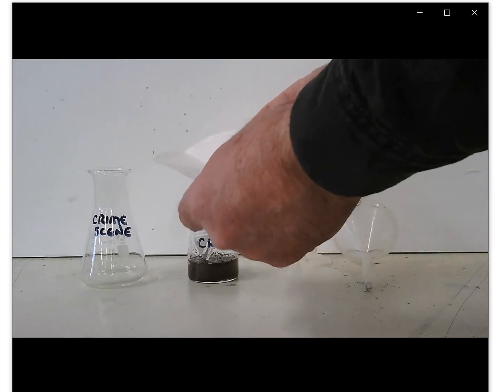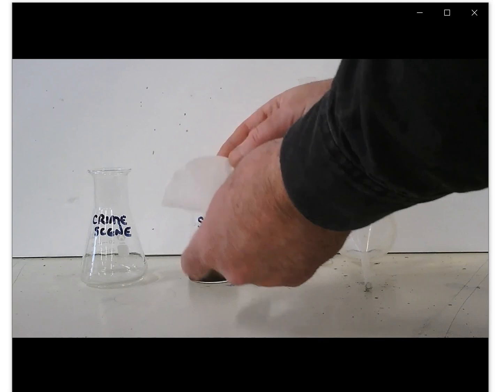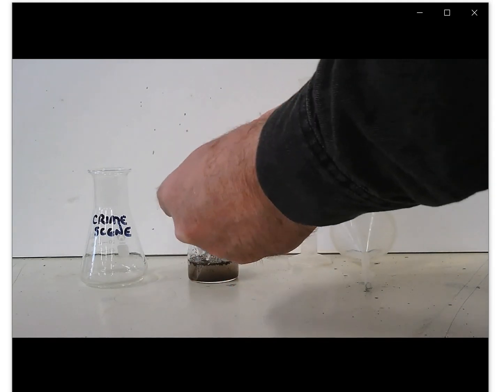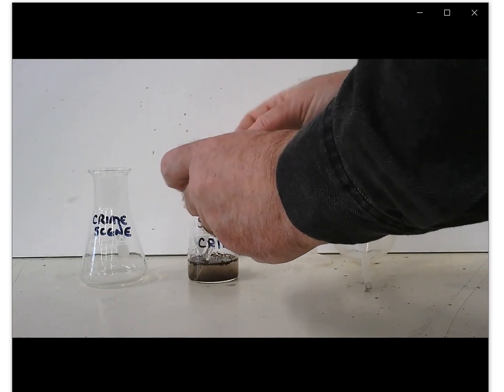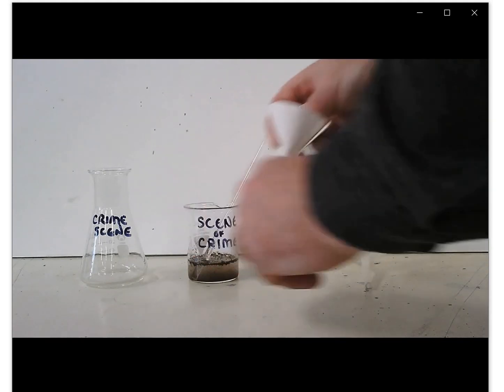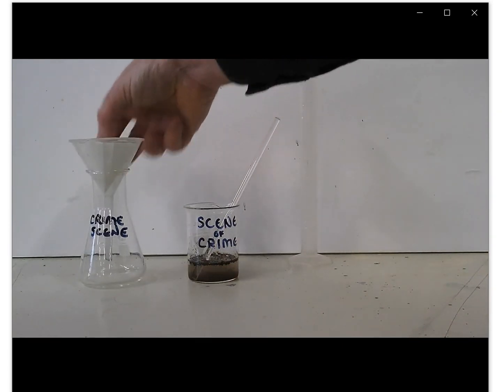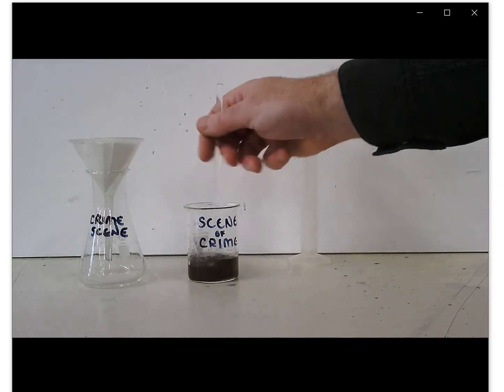We then set up our filter paper. And we filter the solution.